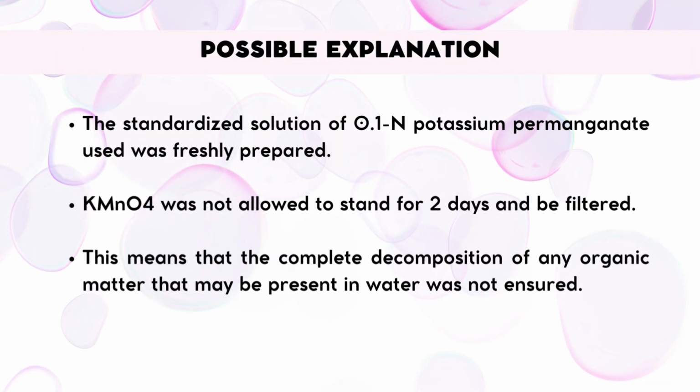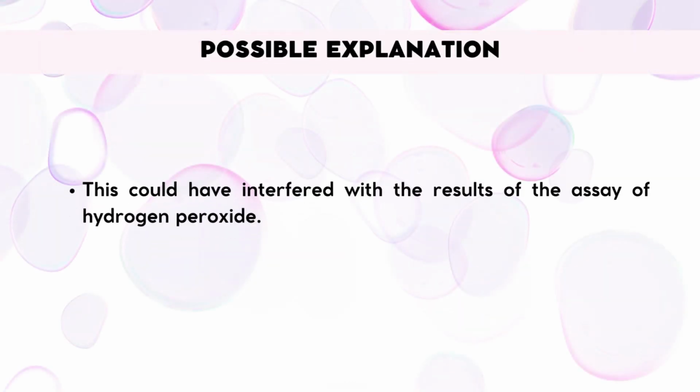The discrepancy in the results could have been caused by the volumetric solution used. Potassium permanganate, upon standardization, should be allowed to stand for 2 days to ensure that no organic matter is present in the solution. This mishap can explain the unconforming results in this assay.